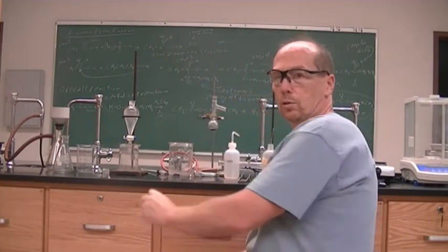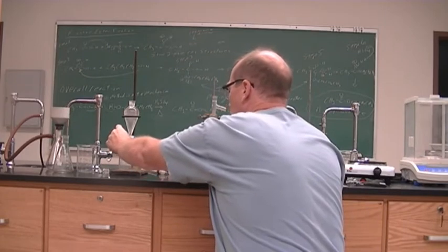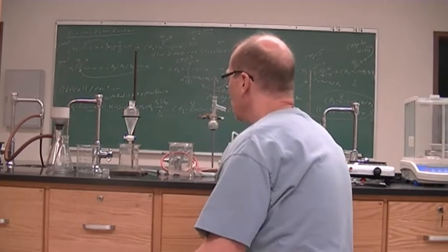Hopefully it will. Still solid, but it is a much smaller amount. Hopefully this small amount will pass through.